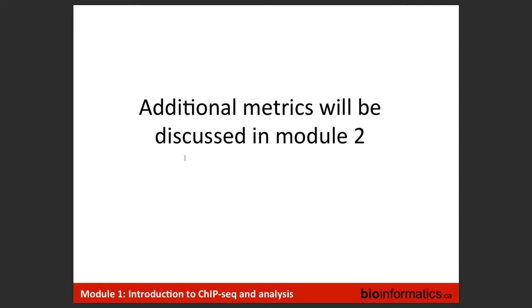And now David is going to start module one, where we introduce the Compute Canada node, and then run through FastQC.